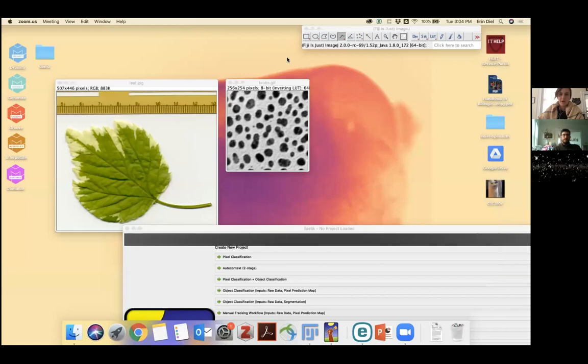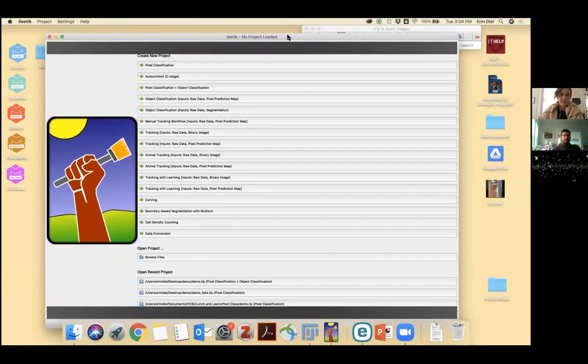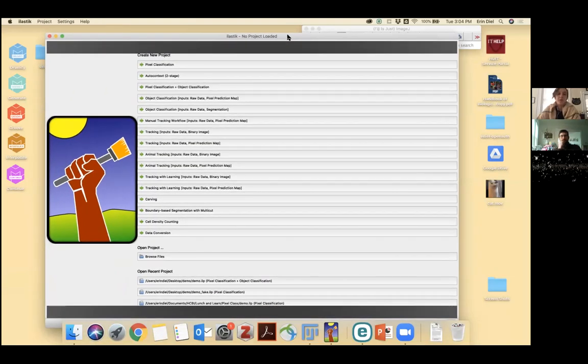So, like Doug said, we're going to talk about machine learning based segmentation. And the reason I wanted to show a couple of other options is because this is a super popular technique right now. It's great to use IntelliSys and Zen if you have access to it, which most of us do now. But for example, I'm working on a Mac, so I'm not able to use Zen regardless of whether the license is publicly available.